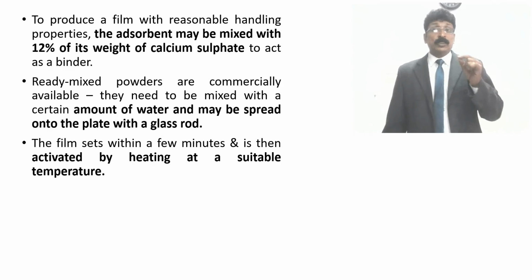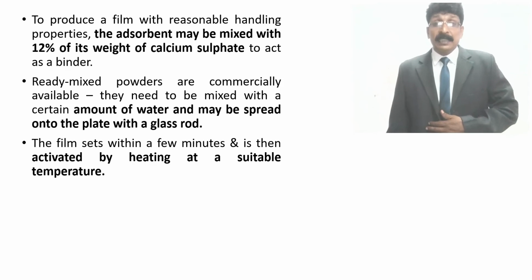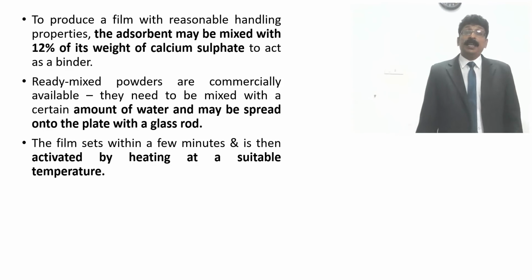so that solvent should be removed, and the water or solvent which may be present may hinder the adsorption capacity for the separation of the compound. So for that, activation is needed by heating at a suitable temperature.